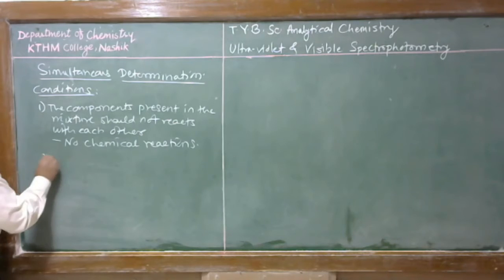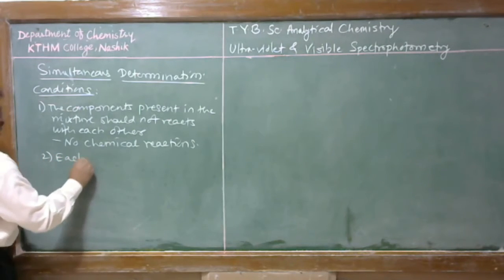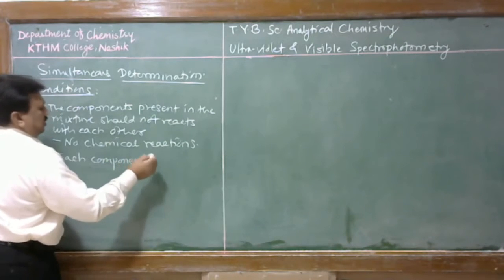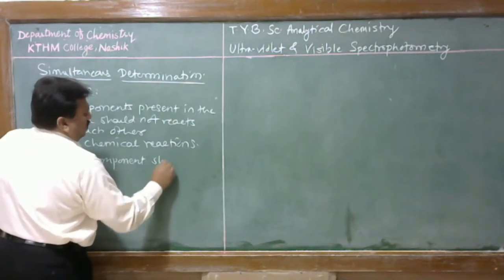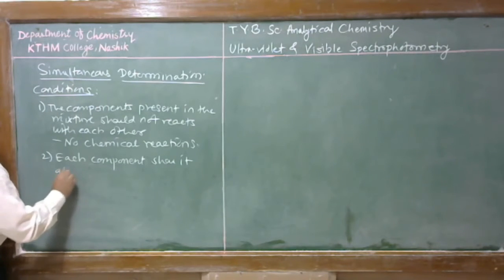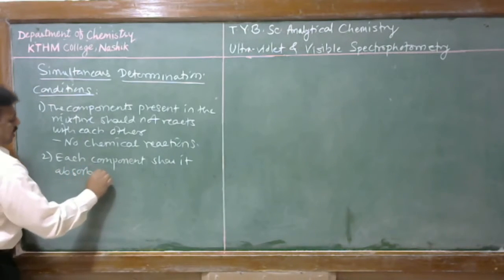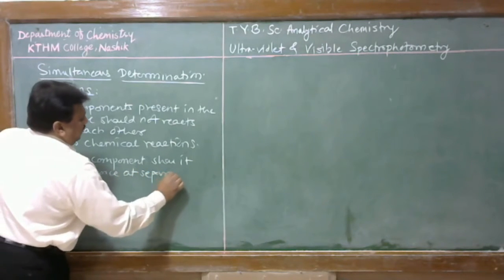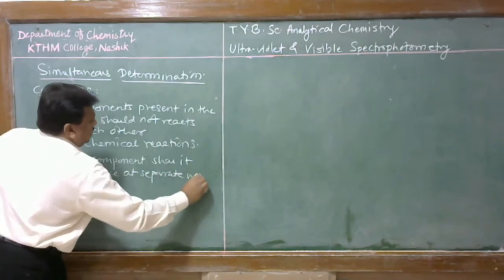Second thing is that each component shows its absorbance at a separate wavelength.